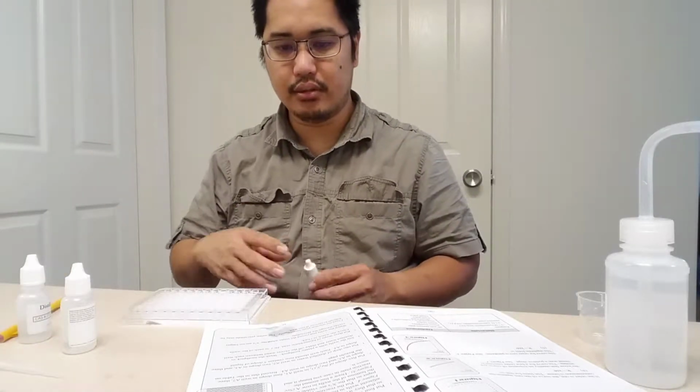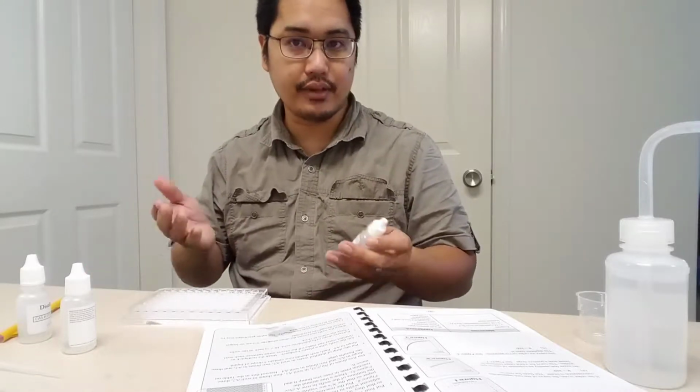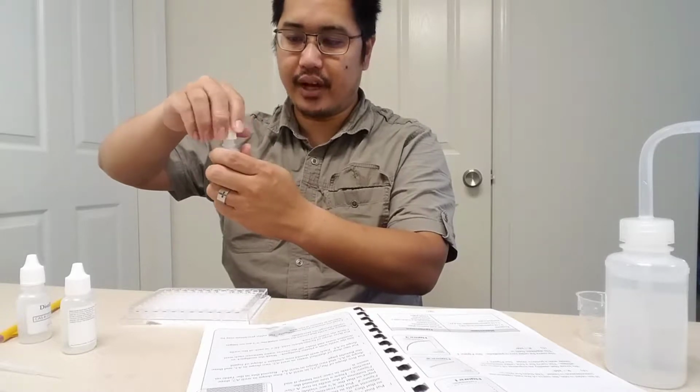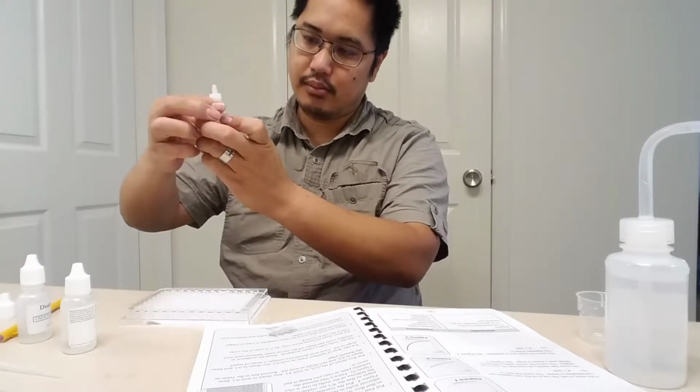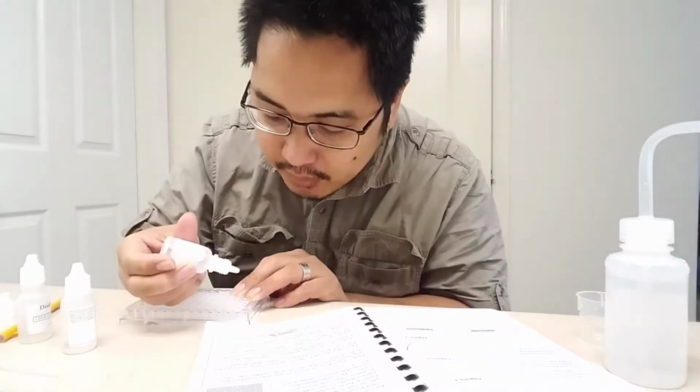So anyway, we're going to put different concentrations of sodium thiosulfate into the wells. We want all the wells to be filled with 5 drops of something. So I'm going to put 5 drops of pure 0.1 molarity sodium thiosulfate in well A1.